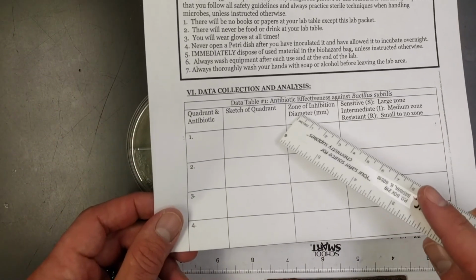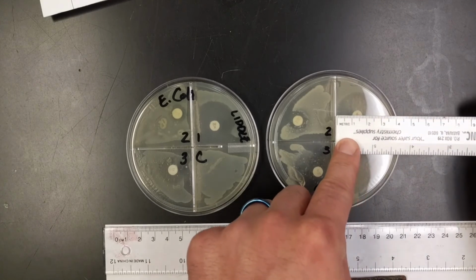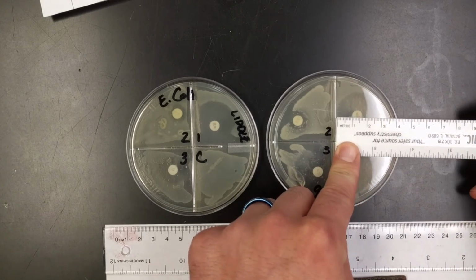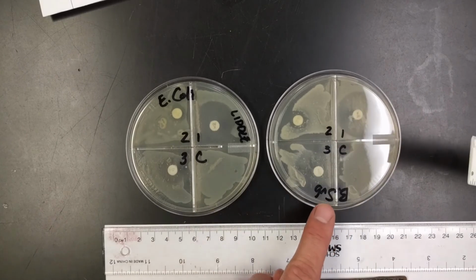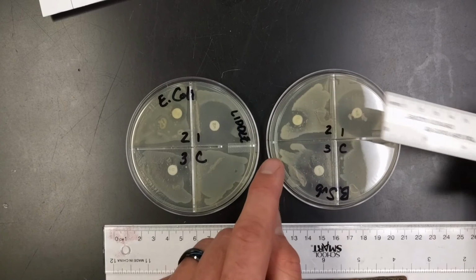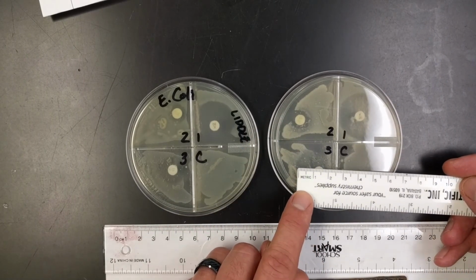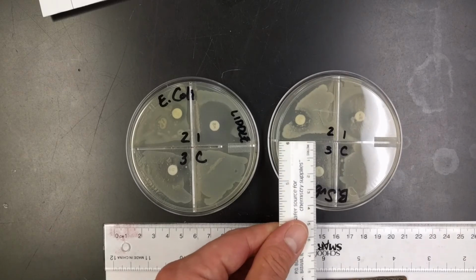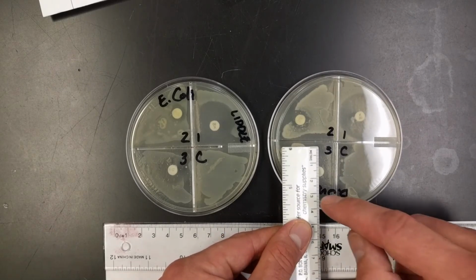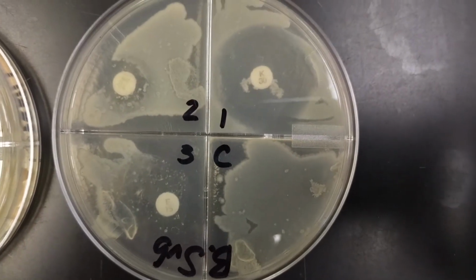Then the zone of inhibition diameter. You got to measure in millimeters from one side of the zone of inhibition to the other one. This one looks about 31 millimeters for number 1 for the B. subtilis. For antibiotic number 2, looks like about 15 millimeters. And for antibiotic number 3, I'd say about 25, 27? Yeah, about 27. And then for the control, 0 millimeters. There was nothing on the control.